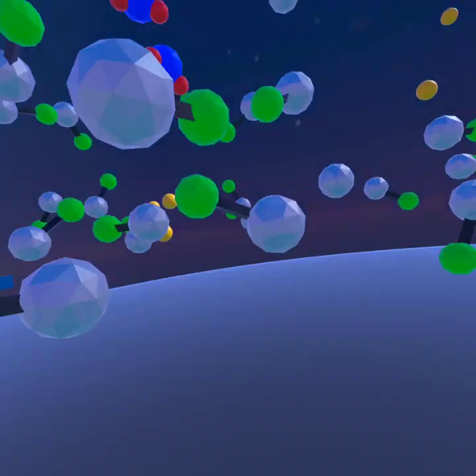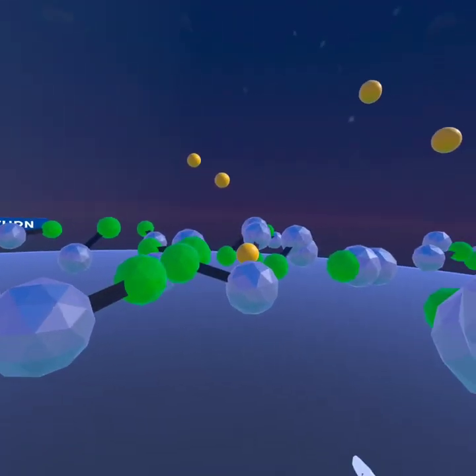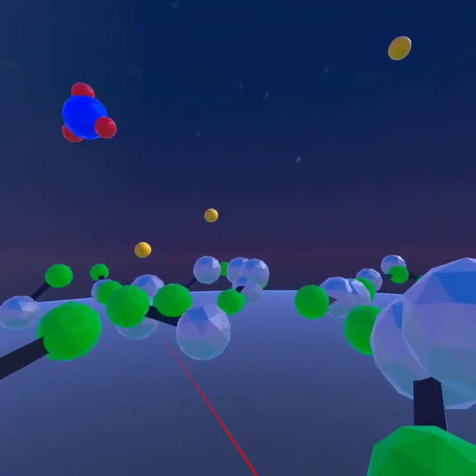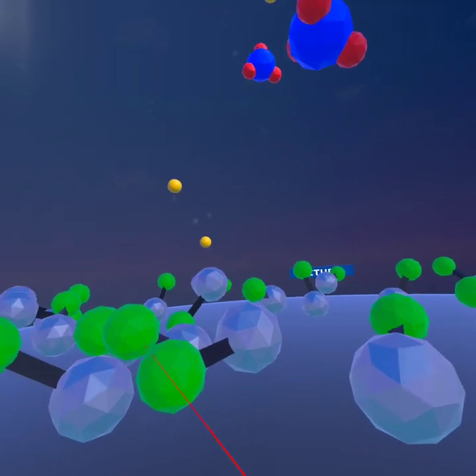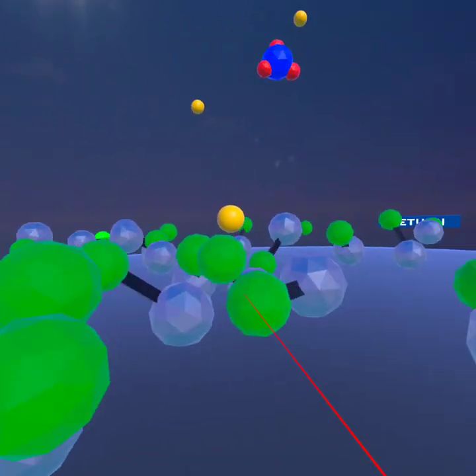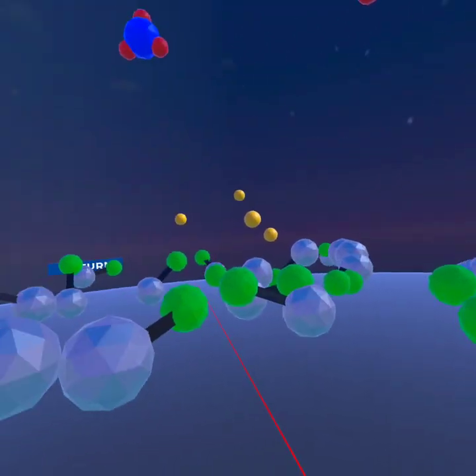Whoa, so what's happening here? Well, what has happened is we have taken the chlorines, these are chlorines, and they have found the silvers, and this bond forms, and they've all sunk to the bottom. This is an insoluble compound. They are no longer ions, they're no longer charged, and because of that, they fall right out of solution.